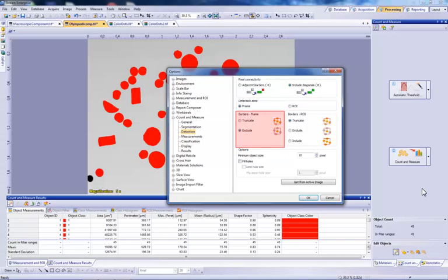The software has the ability to truncate or exclude objects that run outside the frame, or to truncate, exclude, or include objects within the predefined region of interest. There is a minimum object size filter to eliminate small noise pixels. The default is 10 pixels.